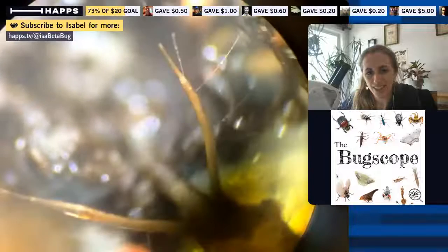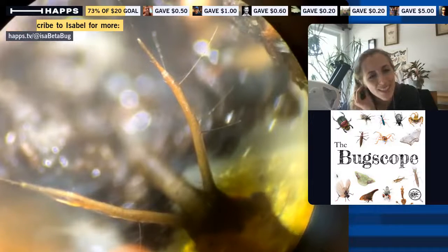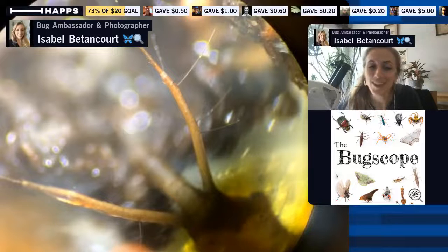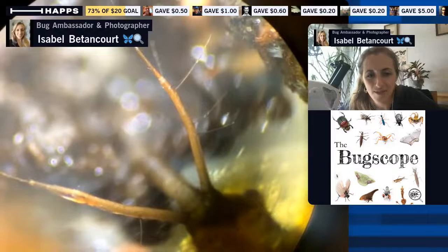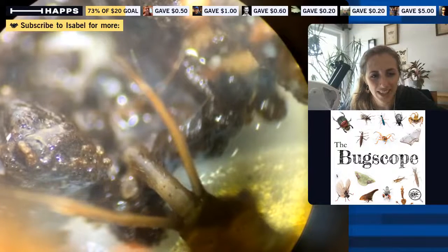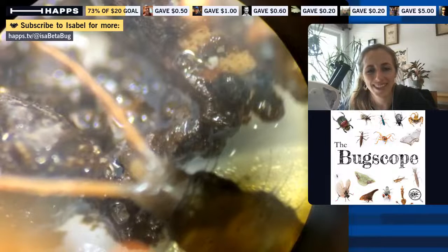Let's zoom into that hind area. Wow, look at those hairs up close — did not see that from farther away. There's probably a lot of sensing going on so nothing sneaks up on it. But a predator can still sneak up and bite it from behind — when you're in the leaf litter you can't really see behind you when you're trailing along like that. That's my guess, but I don't know for sure. David's putting 'cerci' in the chat to help us out.